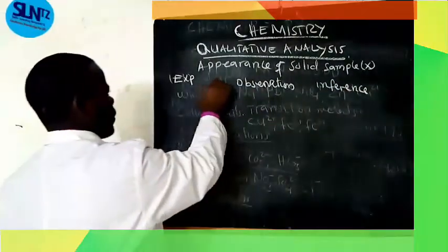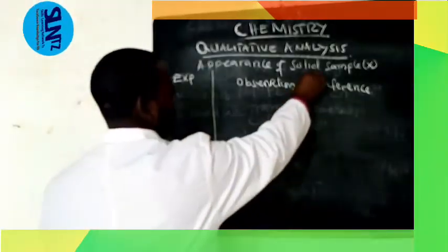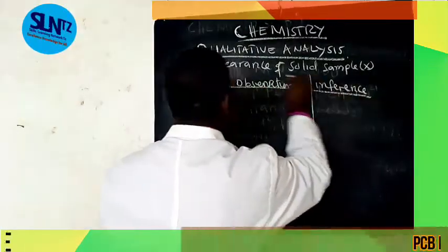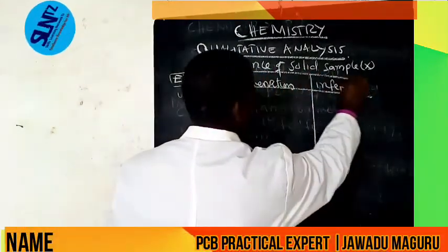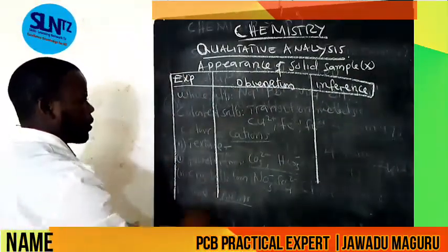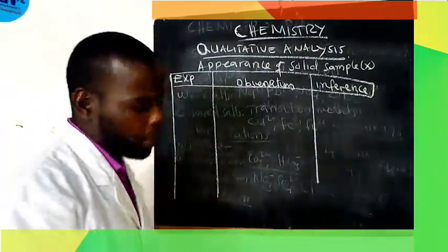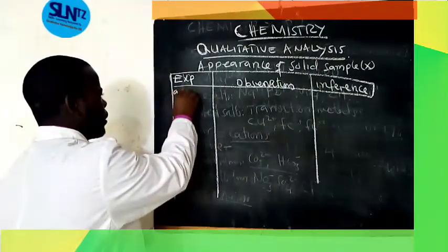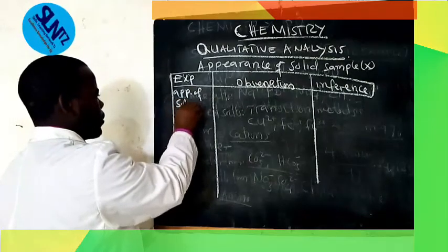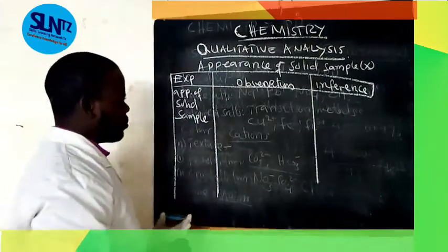Experiment: appearance of solid sample. Observation.